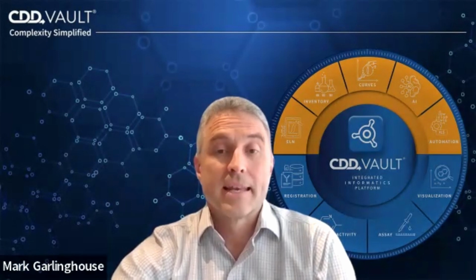In essence, our AI module is designed to streamline your processes, enhance your insights, and accelerate your path to breakthrough discoveries. Now, I'll hand it over to Susanna for a live demonstration of these features. Susanna, over to you.